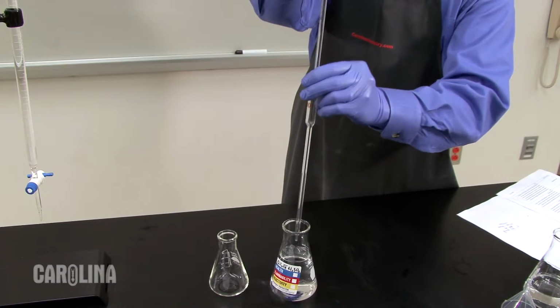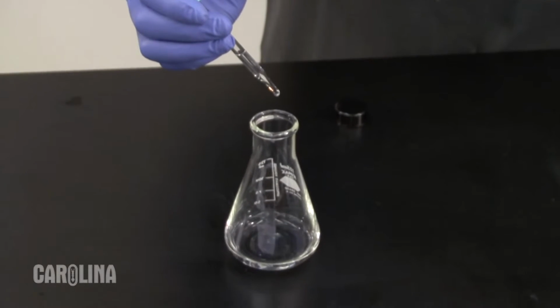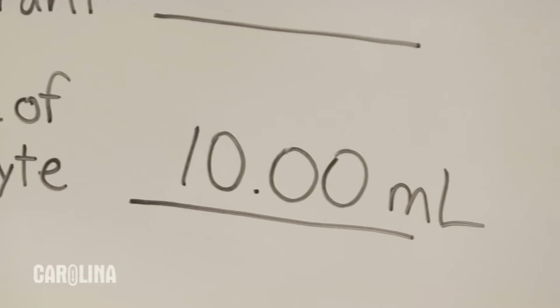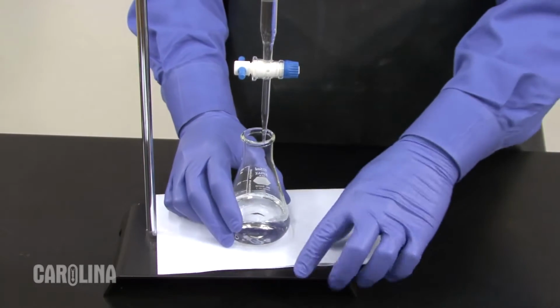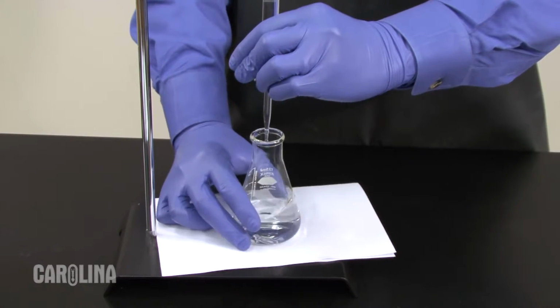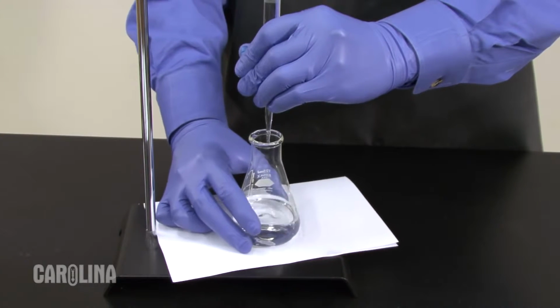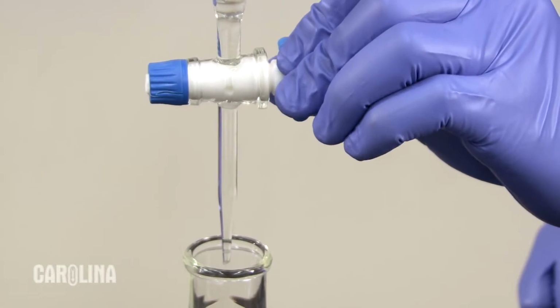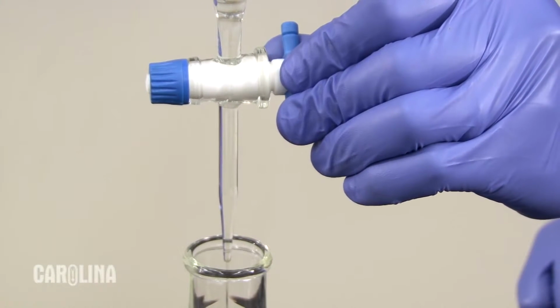Use the volumetric pipette to transfer the analyte to the flask. Add a few drops of indicator to the flask and swirl. Place the flask under the tip of the burette. Record this volume. Placing a piece of white paper under the Erlenmeyer flask may make it easier to detect the color change. Operating the burette requires two hands. One hand turns the stopcock, while the other hand swirls the flask. Practice turning the stopcock a few times to familiarize yourself with how quickly the flow starts and stops.